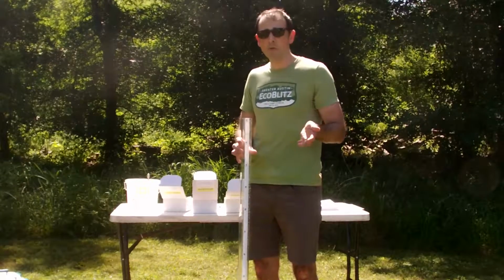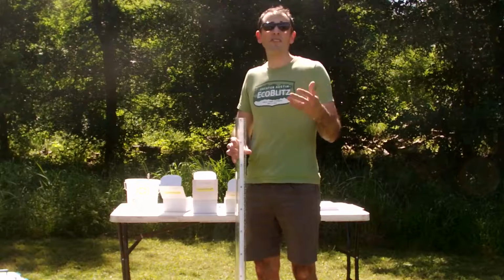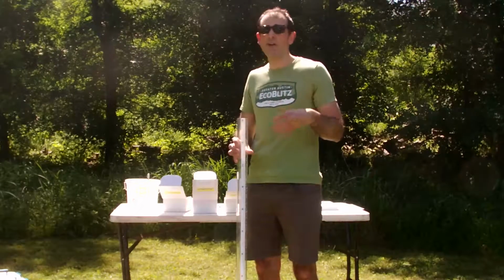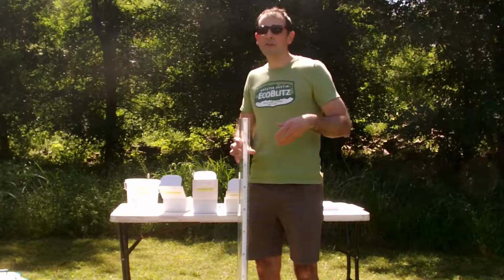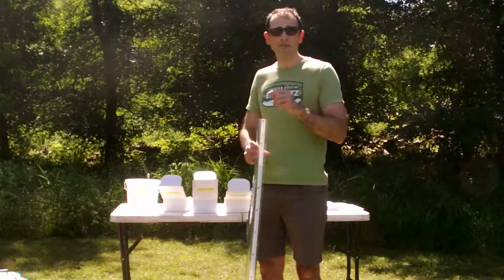measure turbidity, which is essentially how clear water is or isn't, based on all the suspended matter that's in there from algae, from contaminants, from pollutants and sediment, clays and silts. We're next going to measure temperature.